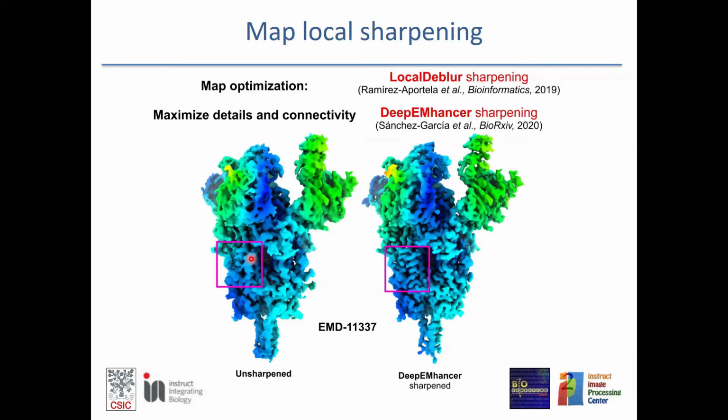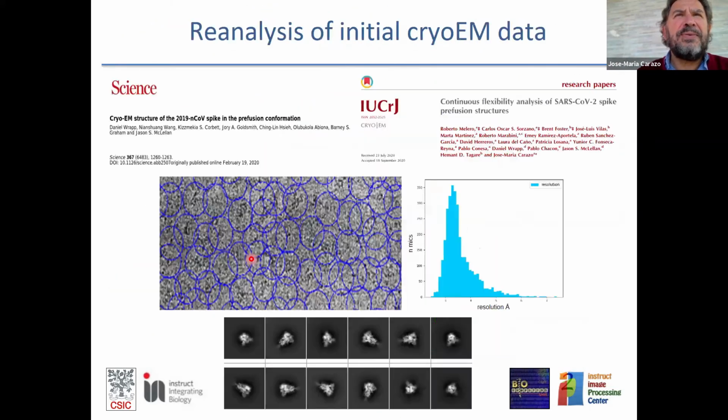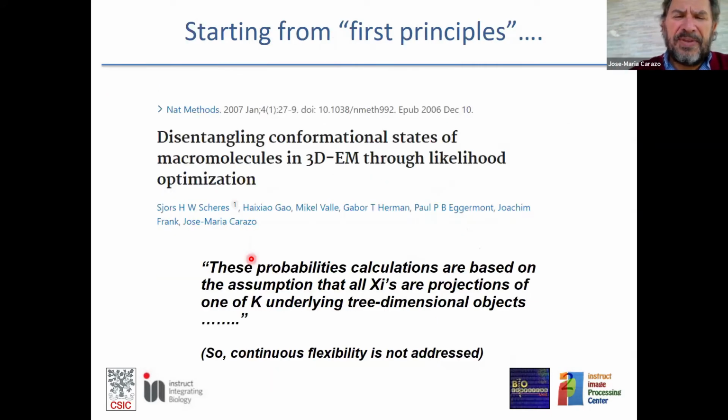Final question. Maybe you want to comment on the spread of continuous analysis methods for continuous heterogeneity. Yes, absolutely. This is sort of the next frontier, because when we consider this constraint or this hypothesis in classification, we did it because we didn't know what to do if we didn't put it. But we all know that this is something to be improved.